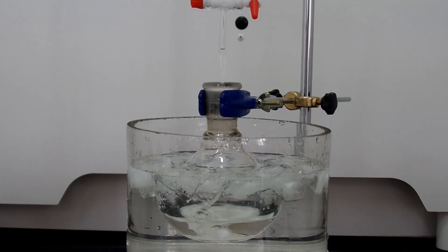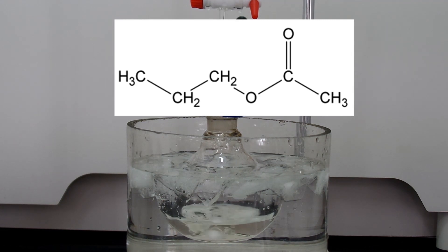In this video, I'm going to make N-propyl acetate, also known as propyl ethanoate. The chemical formula is shown above.